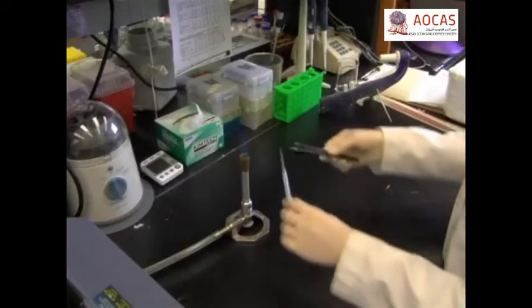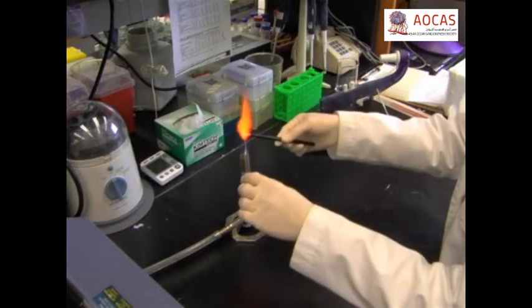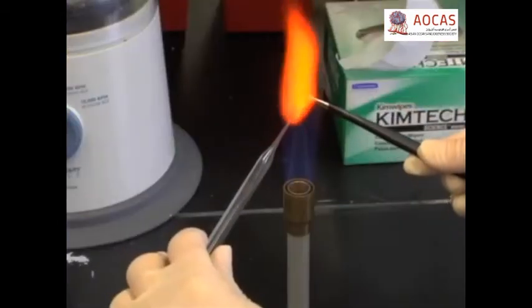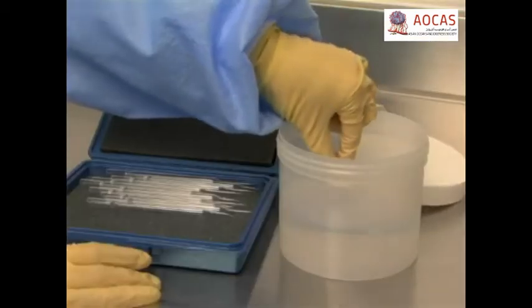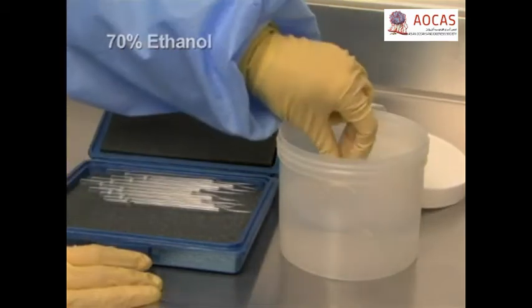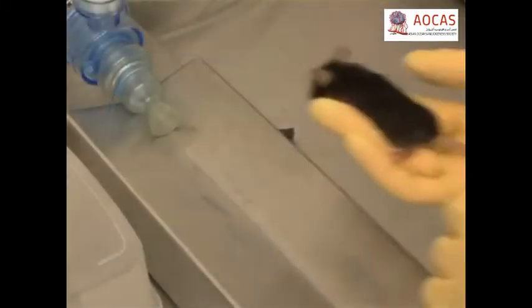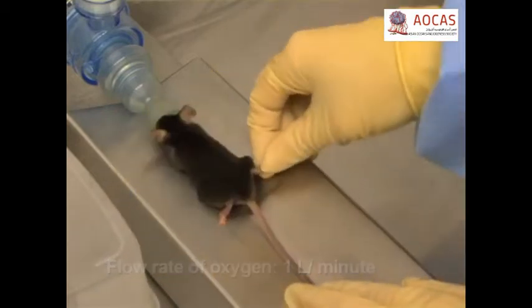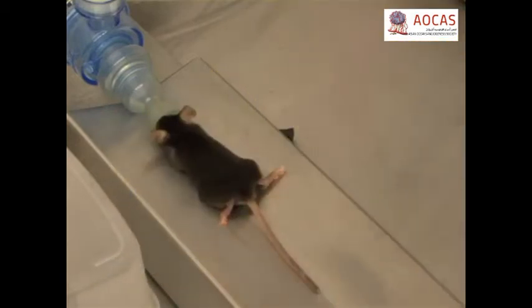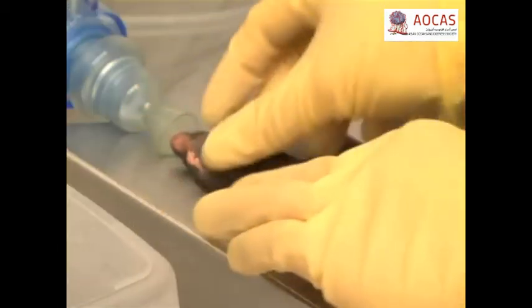To surgically implant the cells into mice, first fabricate a thin glass rod by heating a glass Pasteur pipette using a Bunsen burner. Using forceps, stretch the end of the pipette out to 2-3 mm in thickness. Let cool, then sterilize the rod in 70% ethanol. Sterilize surgical instruments and gut sutures by autoclaving. Anesthetize the recipient mouse with 2-3% isoflurane. Perform a toe pinch to check for the proper level of anesthesia. Lay the mouse on its back with its nose inside the isoflurane dispensing cone and immobilize the limbs with tape or other removable adhesive.